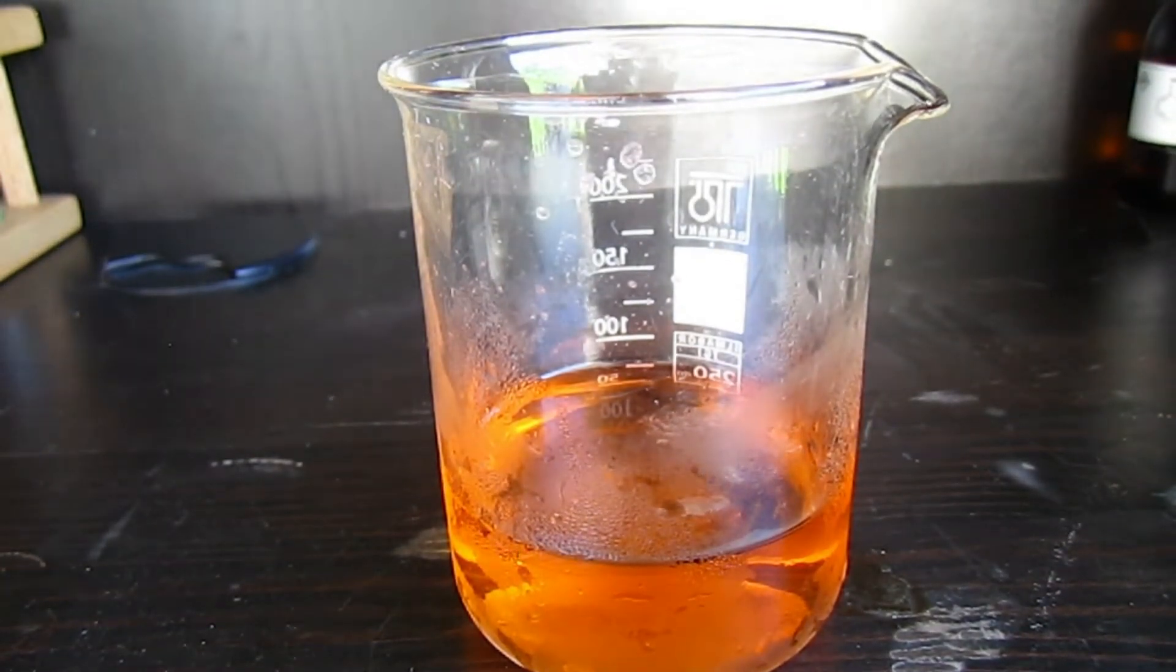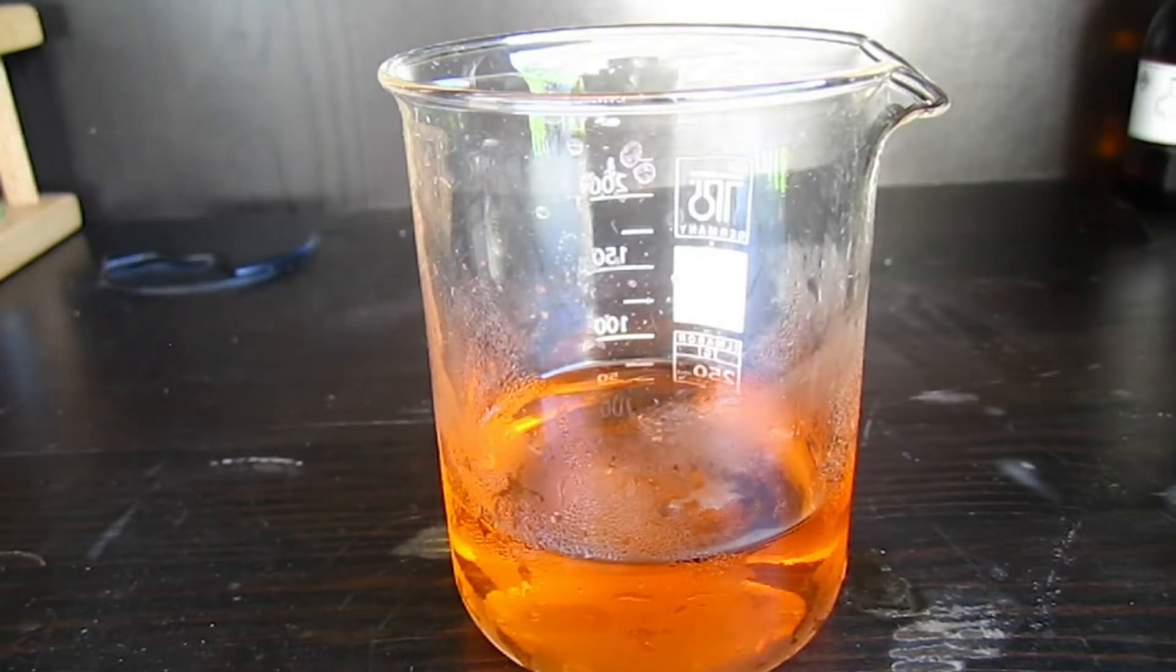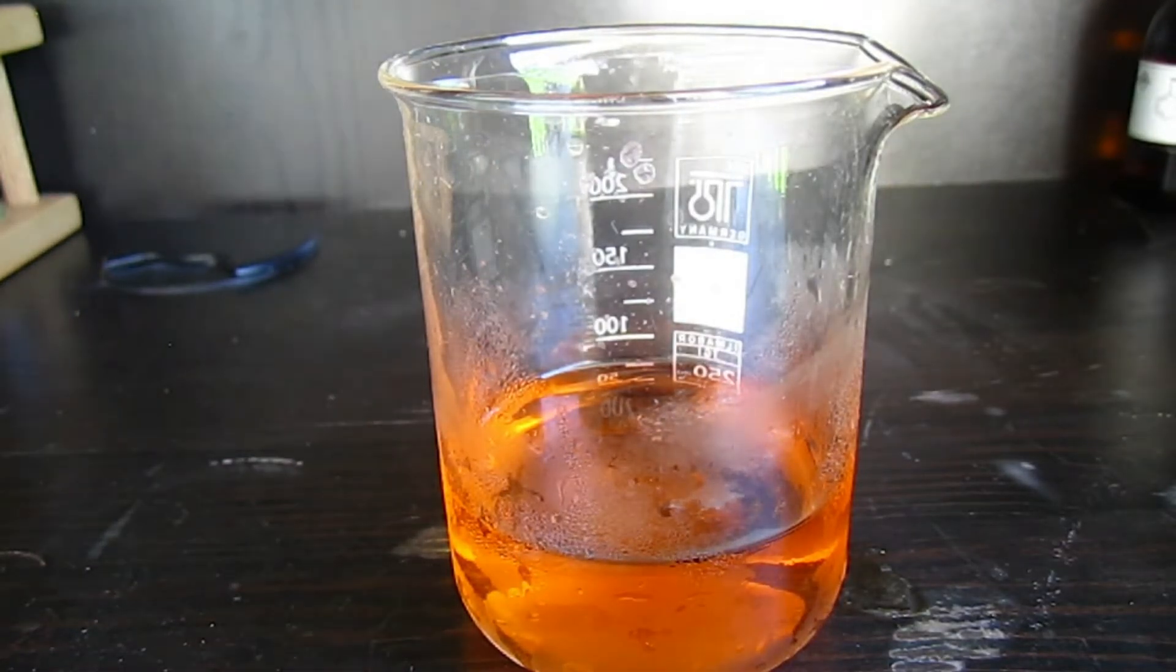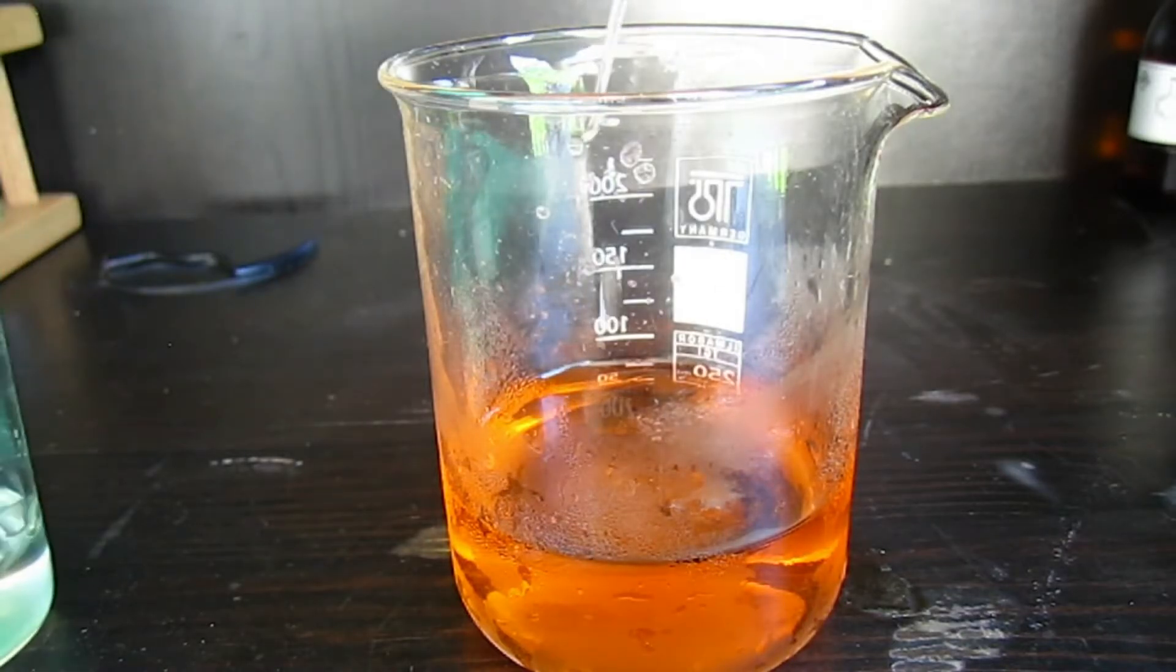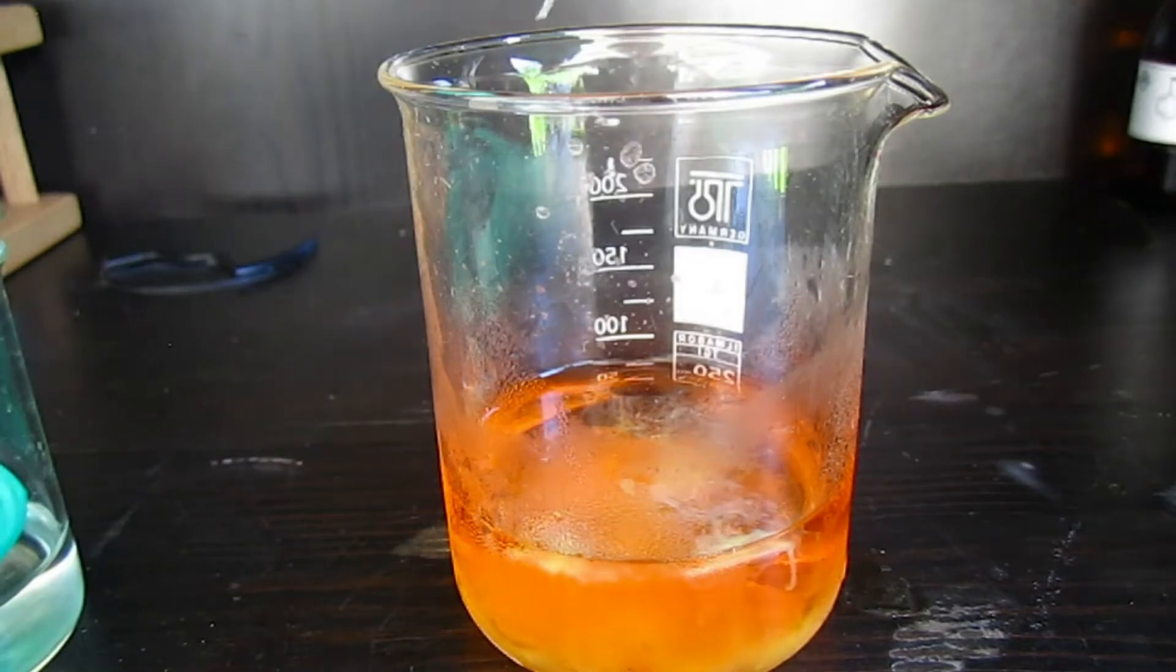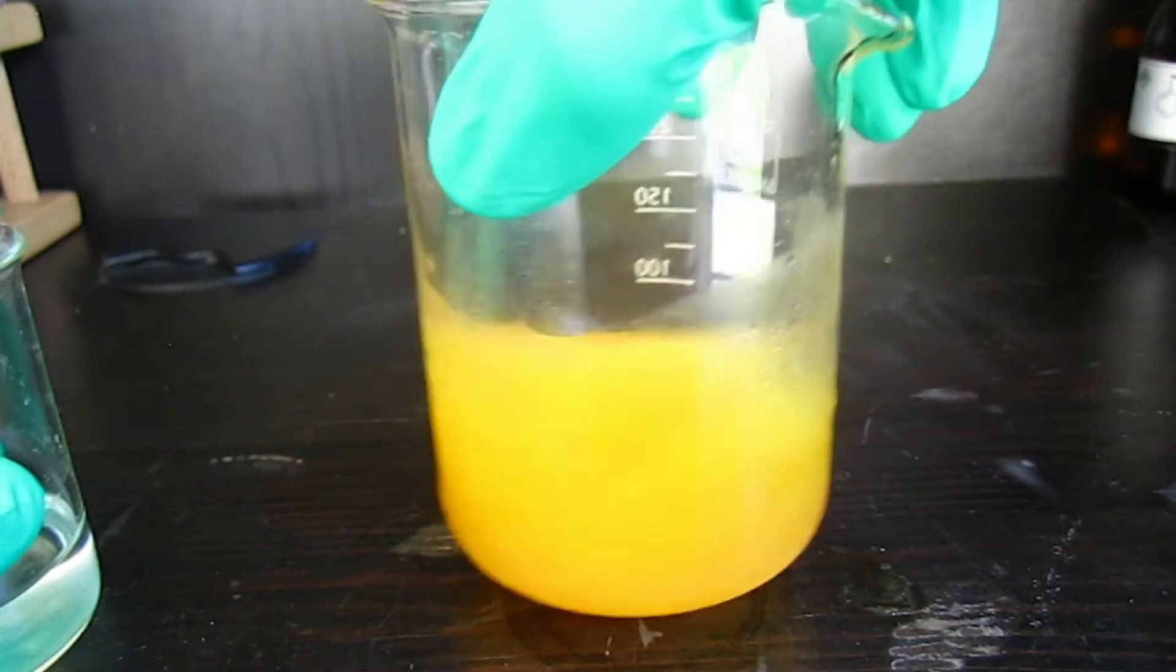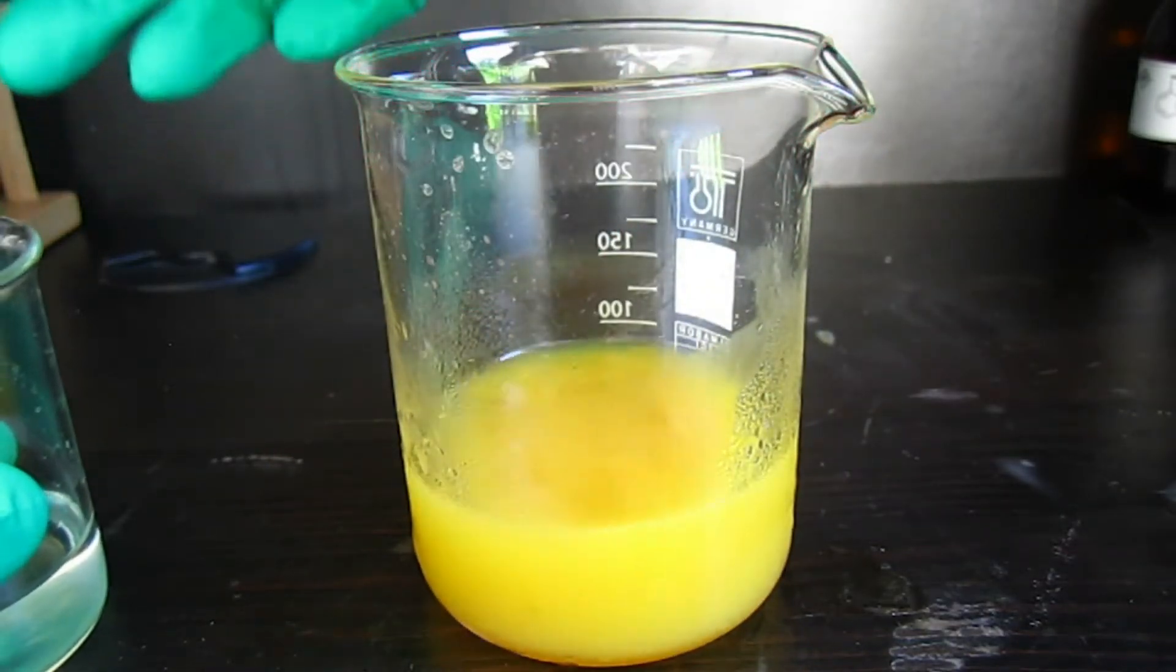So now we're going to add the sodium acetate solution over about five minutes. As you can see, there is a yellow precipitate forming and that's our product, diazoaminobenzene.